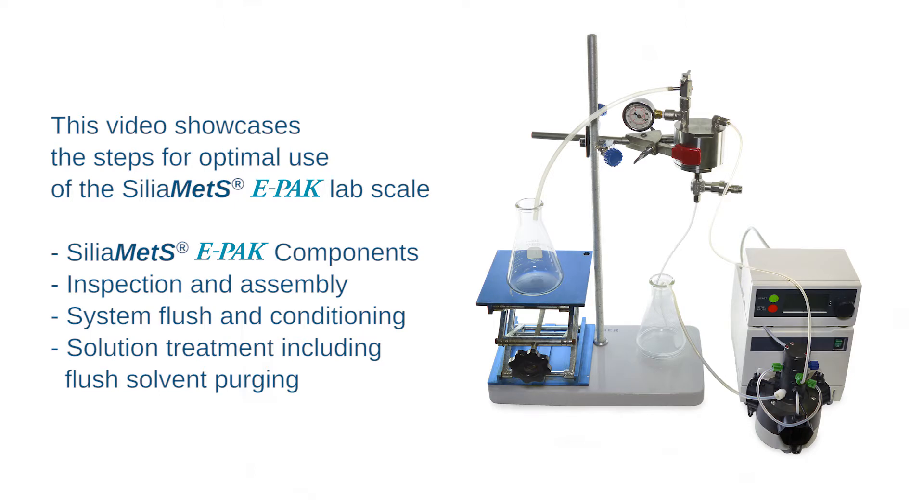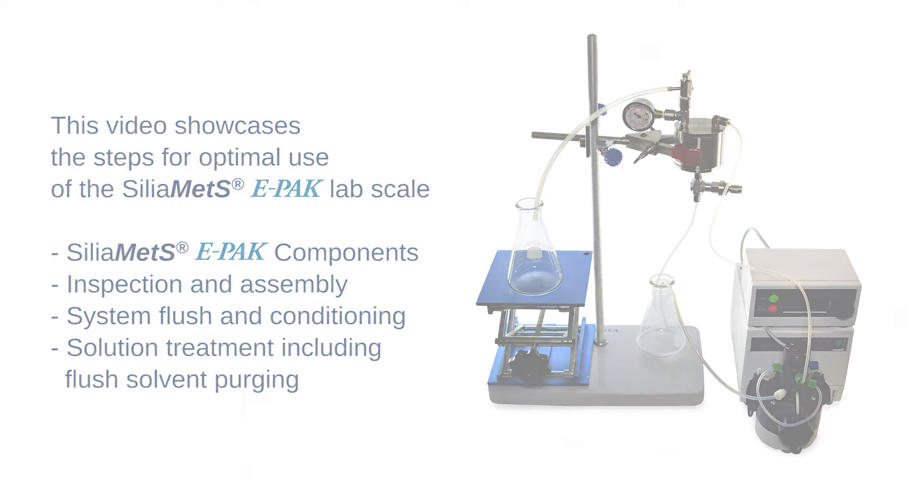SiliaMet E-PAK components, inspection and assembly, system flush and conditioning, solution treatment including flush solvent purging.